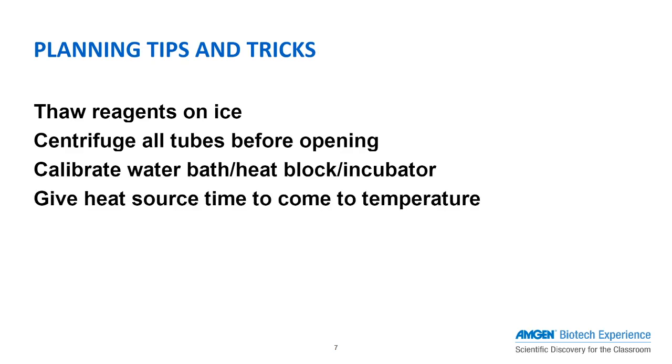On the day of the experiment, before you start setting up the rest of the lab, turn on the heat source or sources and allow them to come to temperature by the time the class starts. When possible, stagger the experimental start times of your students to avoid overcrowding at the water bath, heat block, or incubator, or ask students to leave their experimental reactions on ice for you to collect and incubate together once they have completed the experimental setup.